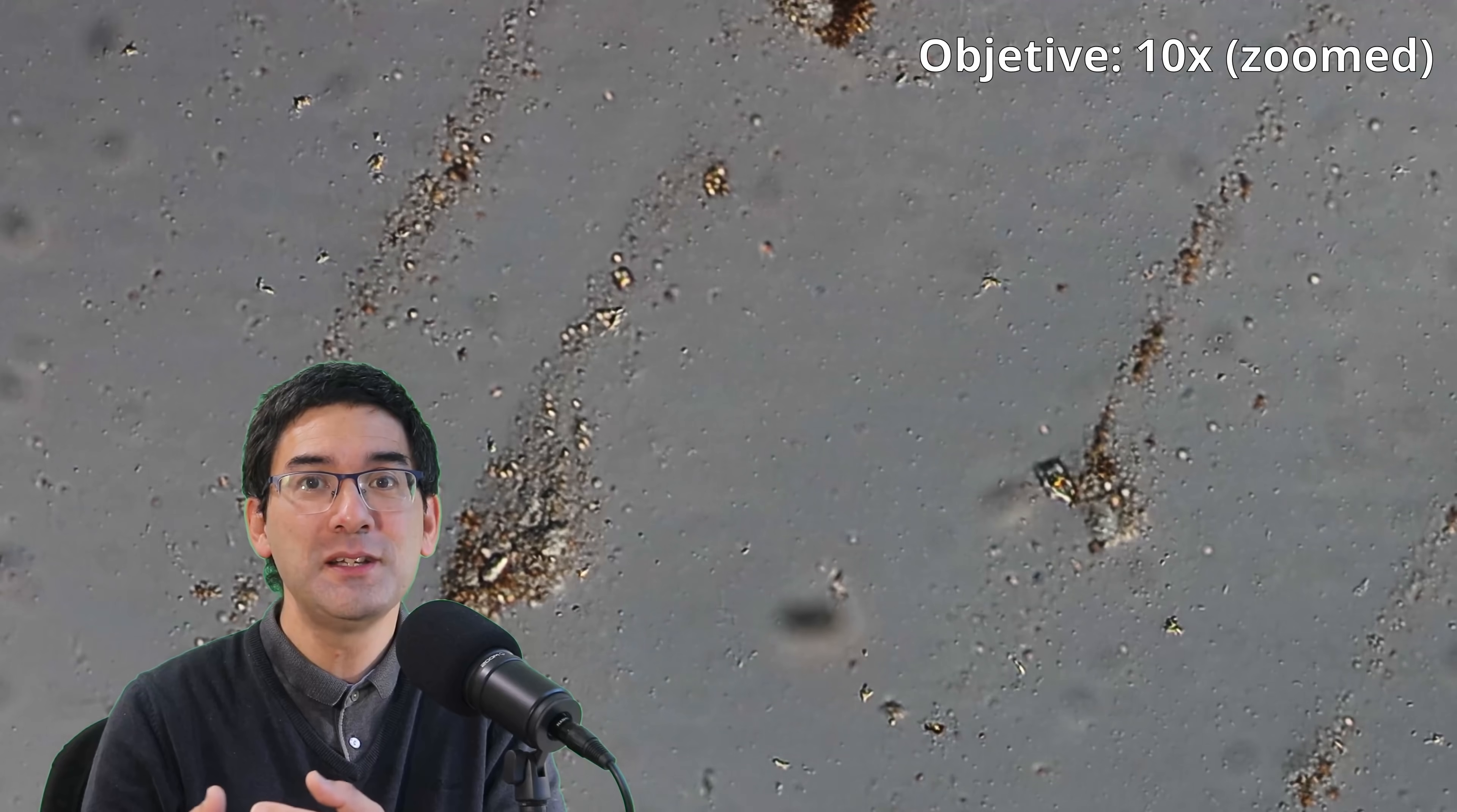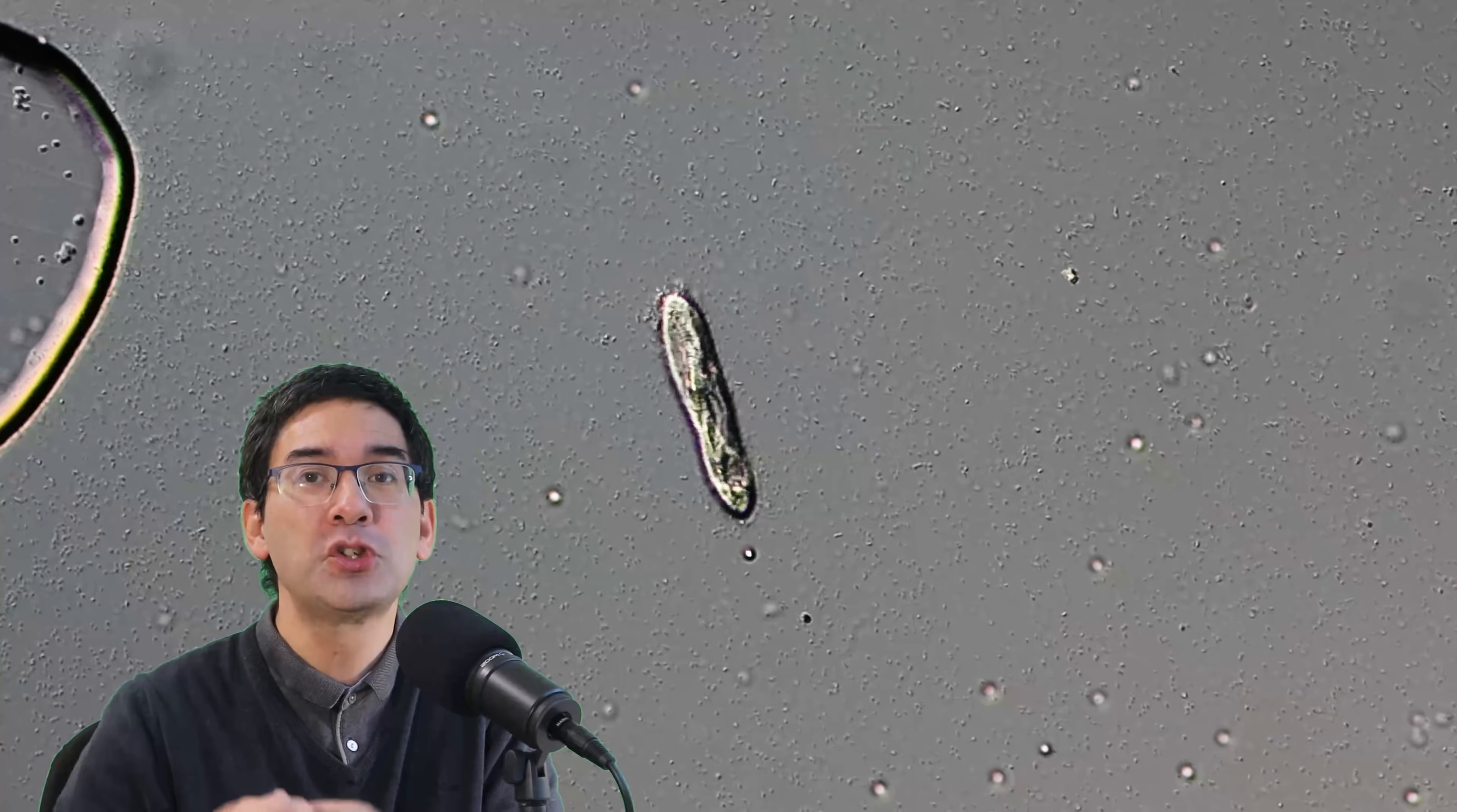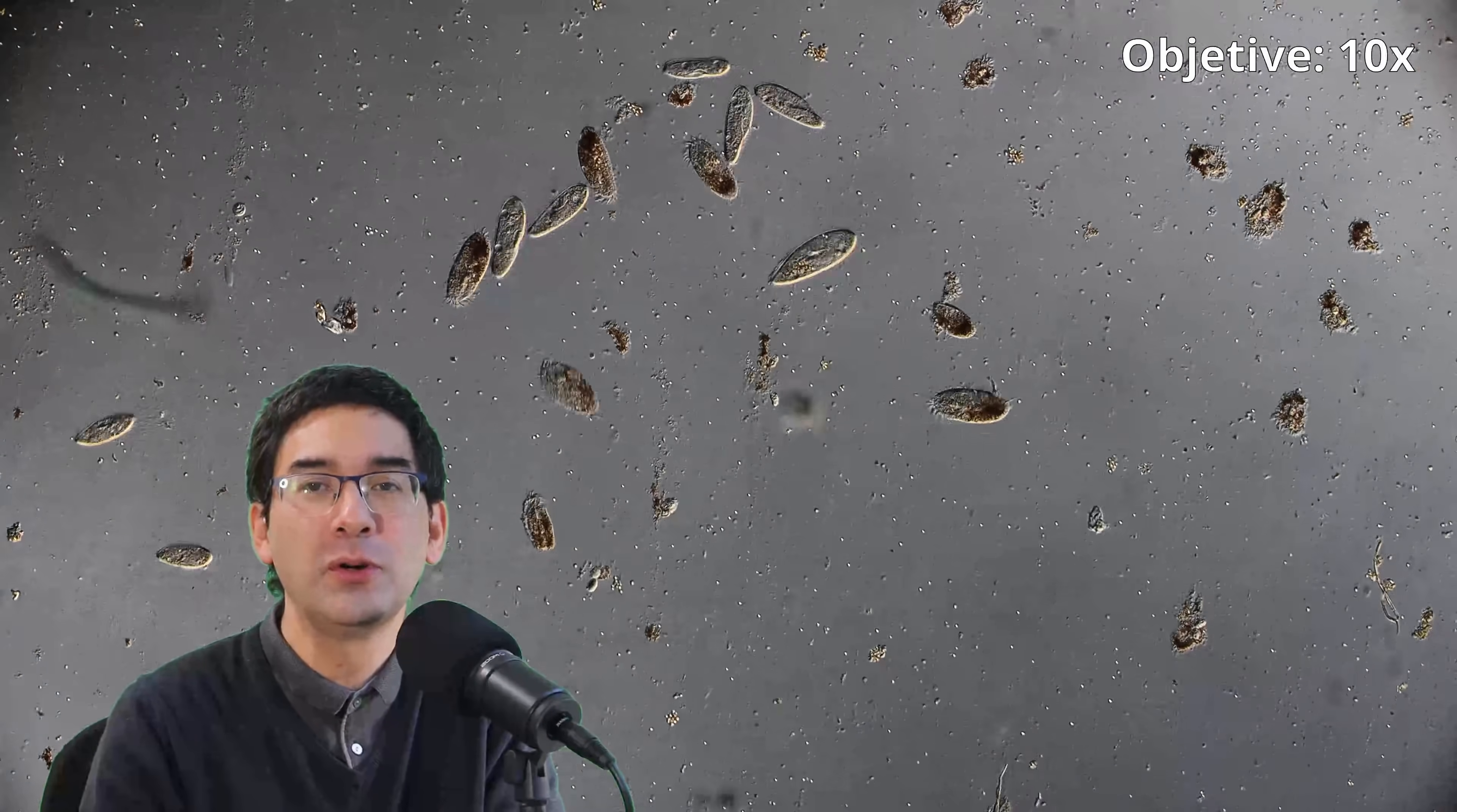I've also seen some paramecia, and those paramecia, interestingly, they don't break open so quickly. But they too, unfortunately of course, don't like the buffer solution quite much. It seems that they start to shrivel up a little bit. I think this is a sign that there might also be some kind of osmotic imbalance happening here - that the buffer solution might also take some of the water away from the cells.